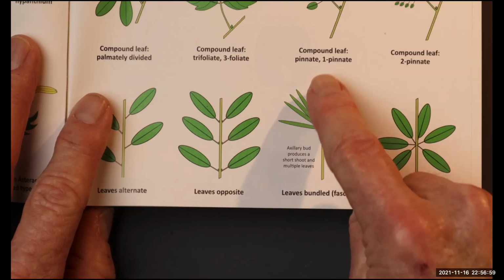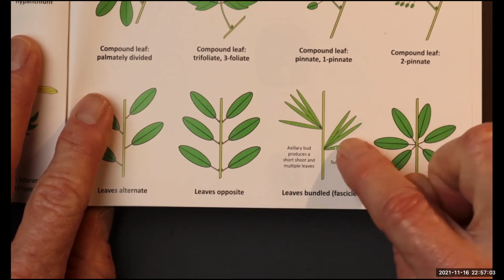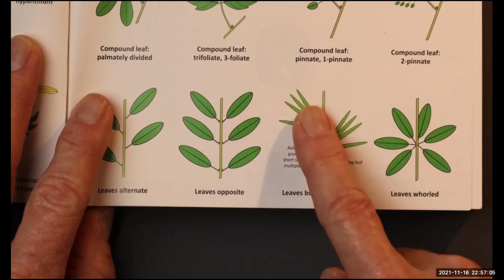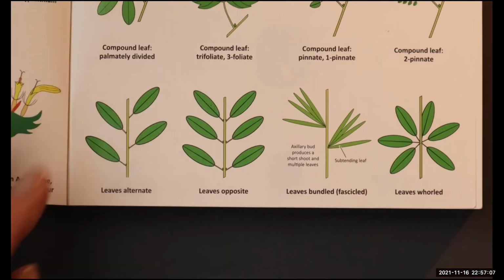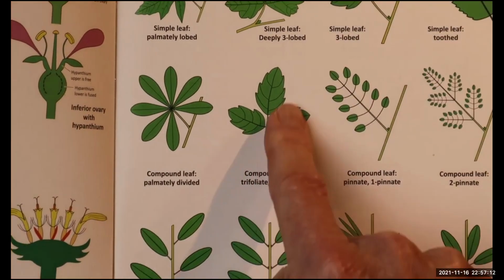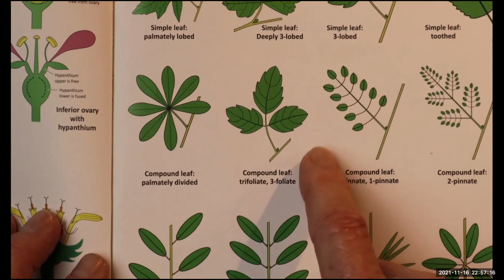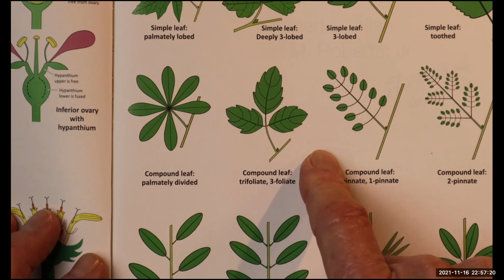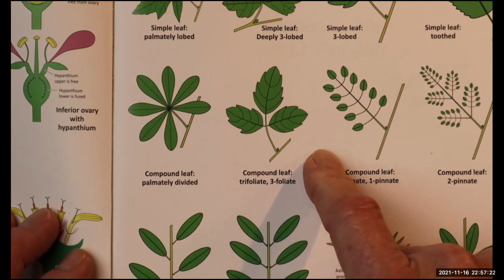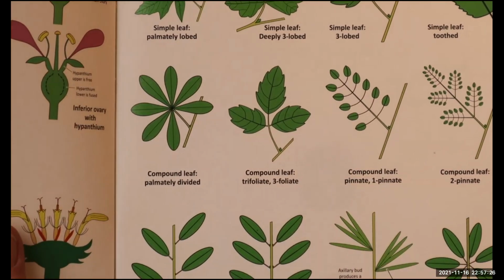Okay, so you can draw a little piece of the stem and then draw one leaf there, and I would draw the other 3 here too. You don't have to draw both bundles, but it would be nice. All right, and while we're here, since you're paying attention, here is poison oak. Yeah, that's my drawing of poison oak right there. So base your drawing on something like that. Might be a little clearer for you. All right, so pause your video and take a screenshot of it, or grab a smartphone and take a photo of it, and you'll have it.